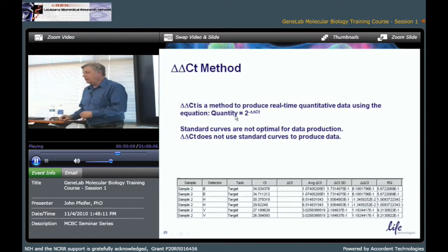Both are possible. So the adeno assays I've been dealing with recently, the researcher wanted to know how many copies of the adenovirus were present. You can either say on a per cell basis or per genome copy number, however you want. That's easy enough. 2 copies per cell, all right? There you go. So what we did is we used the RNase P assay as a measure of the number of copies of human DNA. And we used, of course, an adeno assay to measure the adeno.